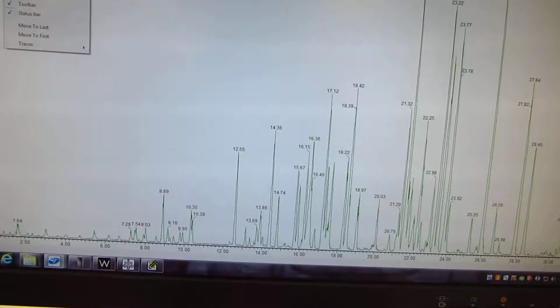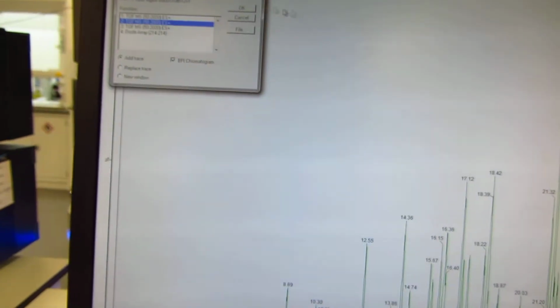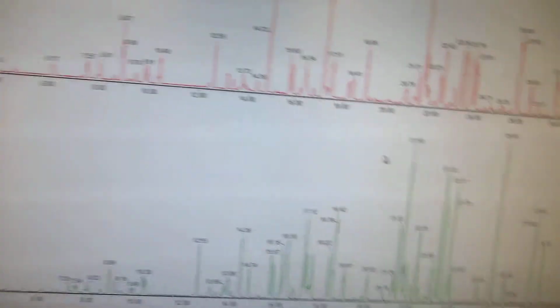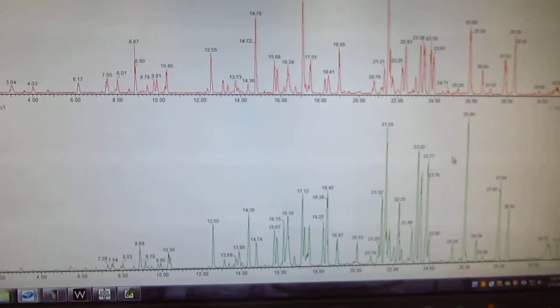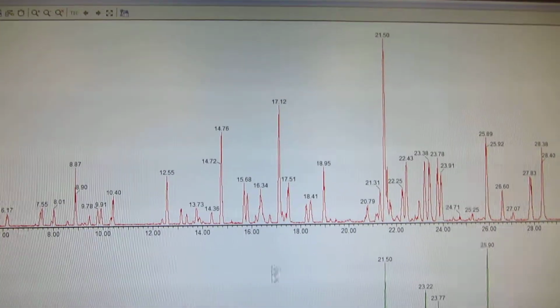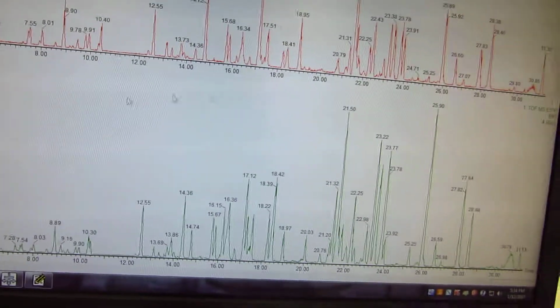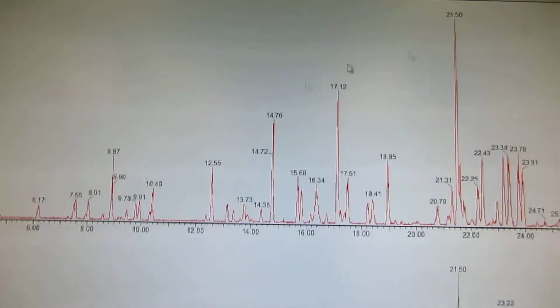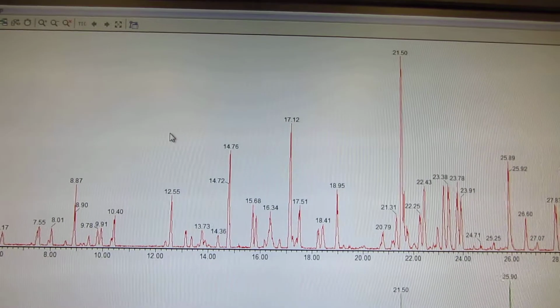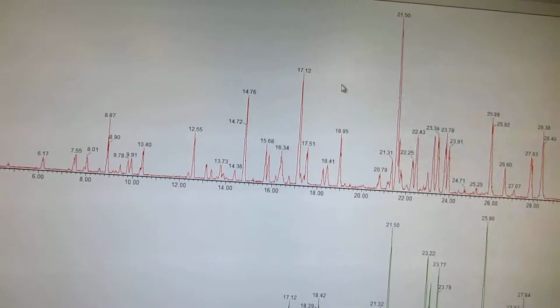Oh, sorry. So the top one is low energy, and you have more response. The top one, sorry, the bottom one is low energy. You have a higher response intensity count, and the top one has a lower intensity.